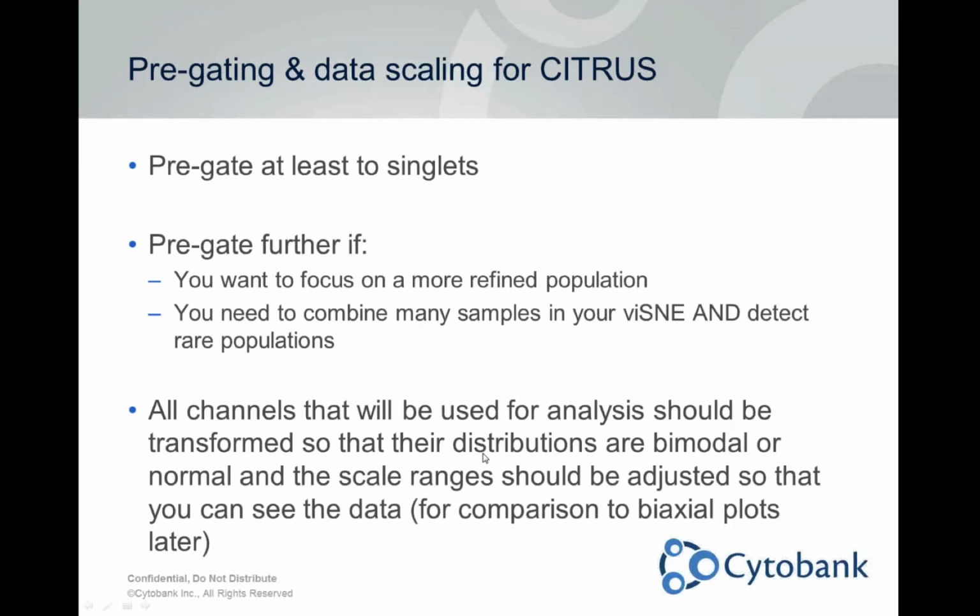If you use data other than flow cytometry data, Citrus will work for any single cell data. So if you're looking for segmented image files or looking to run Citrus on single cell RNA-seq data, for instance, just make sure that your data is distributed like that.